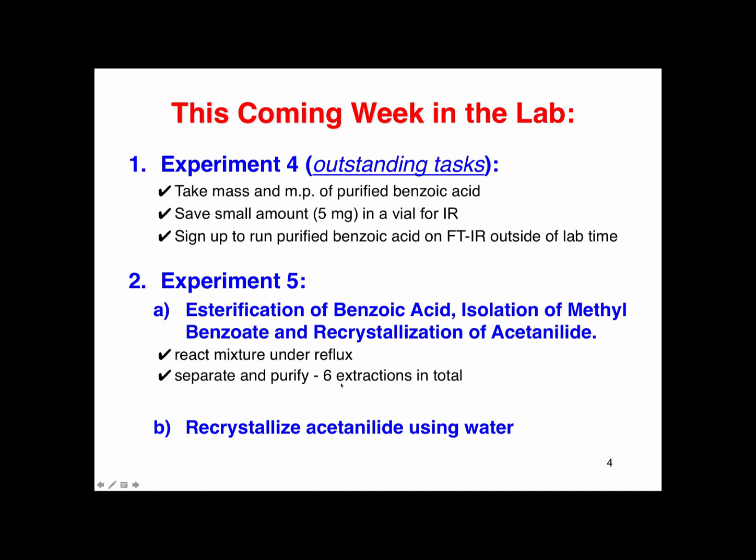And then this recrystallization of the acetanilide, and the solvent that you're going to use this week is water. So you're now experienced with using water for crystallization, but there's a bit of a twist in this one this week. Acetanilide, because of its melting point, as you're heating it up, it will most likely oil out. So rather than like the benzoic acid where you had solid in it, you had to keep adding water until the solid finally dissolved at the boiling point.